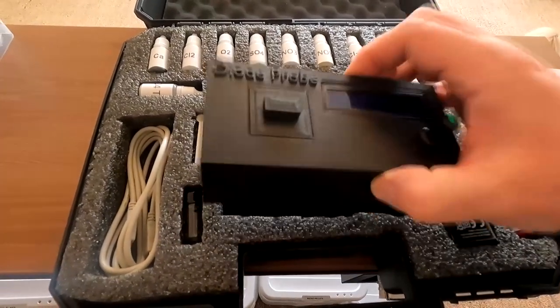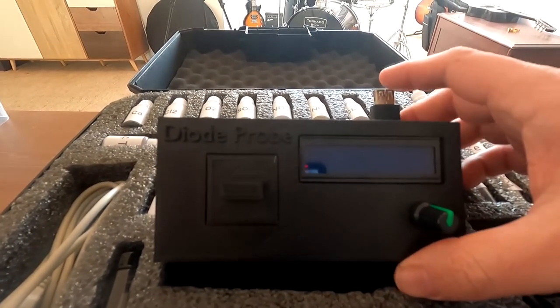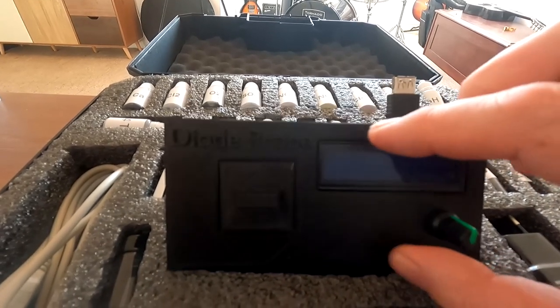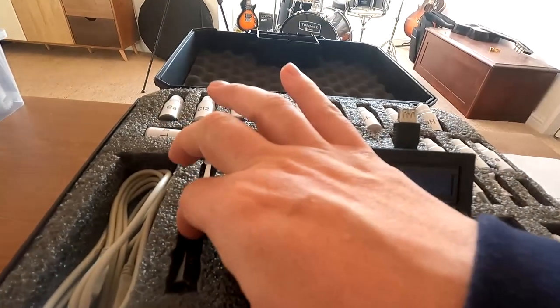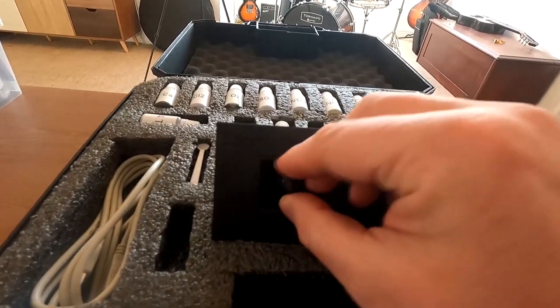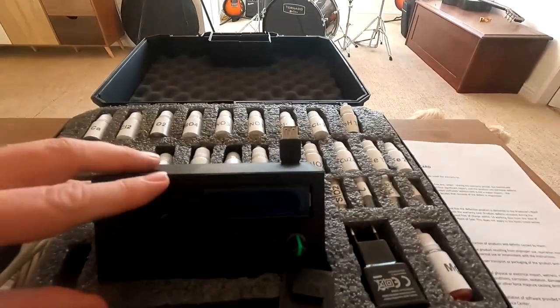This is the main unit here. It's USB connected, but that's just for power — it doesn't connect to your computer or anything like that. There's a little display and a little window where you put your sample of water. You select the test you want and away you go. It's really that simple. It does come with instructions.